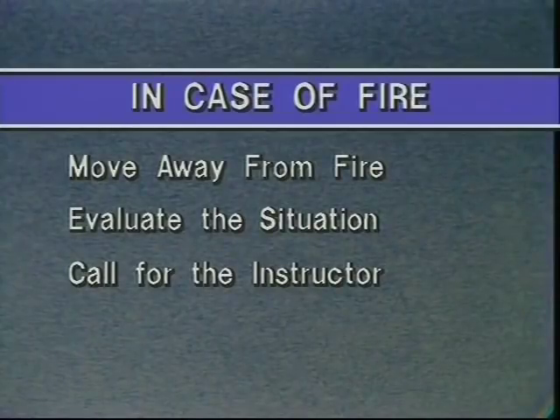If there's an explosion or fire, remain calm and get help quickly. Remember, all accidents, no matter how small, must be reported to your instructor. These reports are helpful in establishing new safety procedures that may be able to prevent similar accidents in the future.